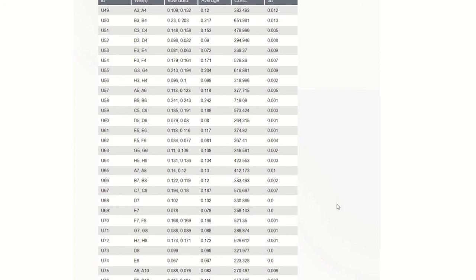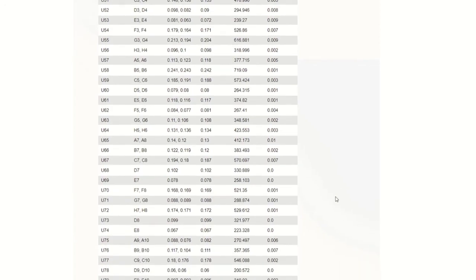And so that's how you determine the unknown concentrations in your sample, whether it's a protein determination or whether it's a particular hormone or assay that you're doing, ELISA that you're doing, and you need to work out what the unknown concentrations are. So now you can go ahead and plot it in Excel to see the concentrations that you've obtained and beautify your graph, as I've shown in the other video, if you want to refer to it.